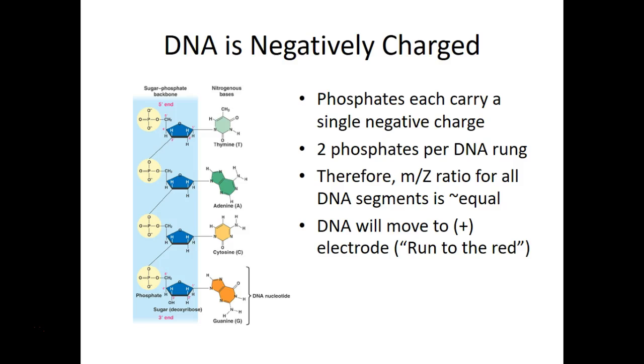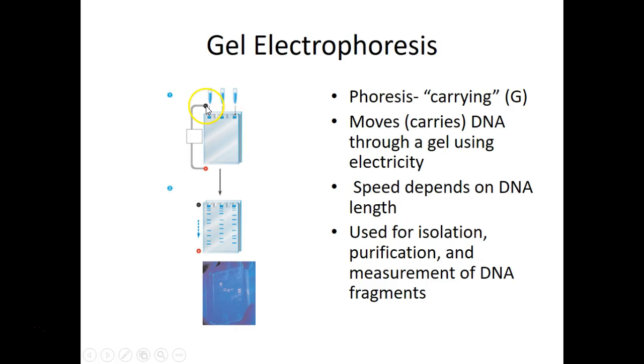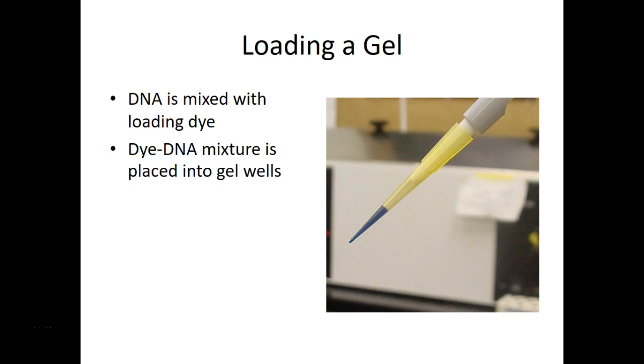So because it's got a negative charge, if I apply a negative charge to this end and a positive charge to this end from an electrode, from a battery, or from plugging a gel box, a power supply into a wall, then DNA with a negative charge will avoid the negative electrode and be attracted to the positive electrode. It'll move through, yeah? And so as it moves through, big pieces will go slowly and small pieces fast.